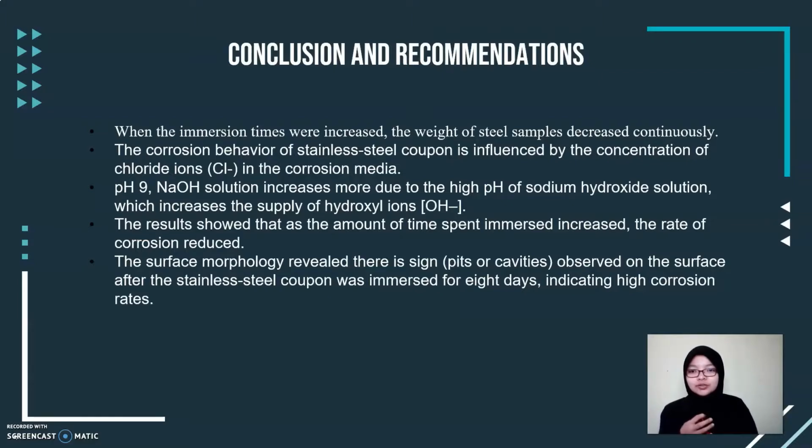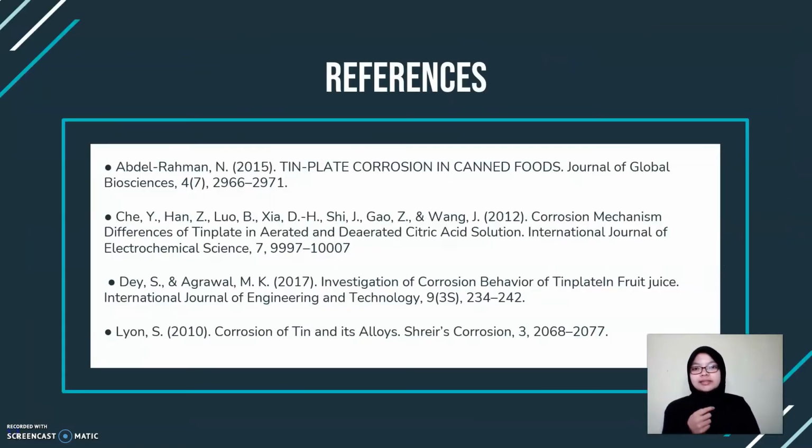The results showed that as the amount of time spent immersed increased, the rate of corrosion reduced. The surface morphology revealed a sign, which is pits or cavities, observed on the surface after the stainless steel coupons were immersed for 8 days, indicating high corrosion rates.